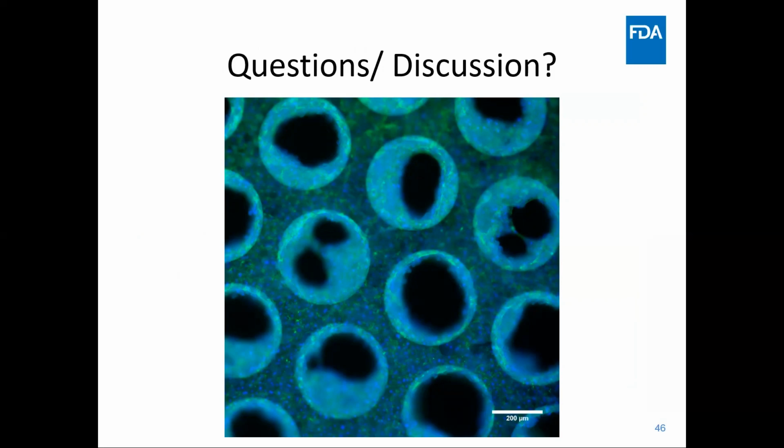So it does make sense to use animal cells and compare the results of chips with these animal cells to the results of all the tests that have been done, for example, for this specific context, the developmental and reproductive toxicity. There are other contexts in terms of toxicity that also use animal systems.